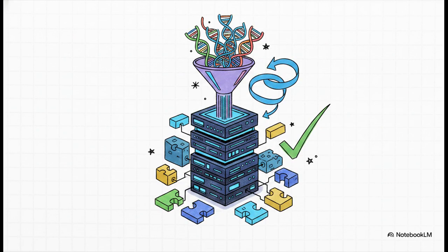On the flip side, the crucial point is that cfDNA Uniflow is your go-to optimal choice if you're operating at an industrial scale. If your lab is processing massive patient cohorts across compute clusters, if you absolutely require that deeply advanced fragment length-based GC bias correction, and you want the extensibility to plug your own custom modules into a robust workflow management system, then Uniflow is your standard.